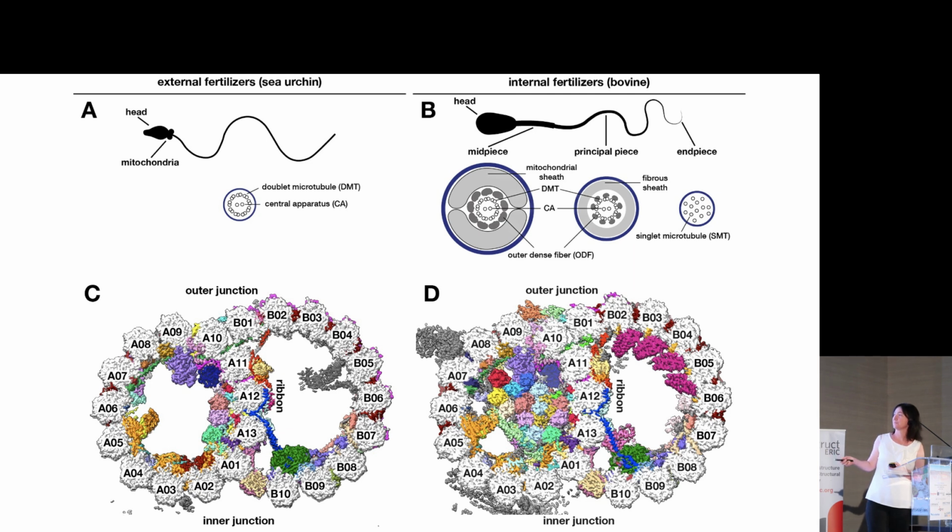the A microtubule. But what I want to show is that in parallel to our structure, there was a group in the US that did the structure from sea urchin sperm that I already mentioned, that is much simpler, has only the axoneme. But you can see that also on the molecular level, it's much simpler, so it does not have many of these extra microtubule inner proteins that we find.